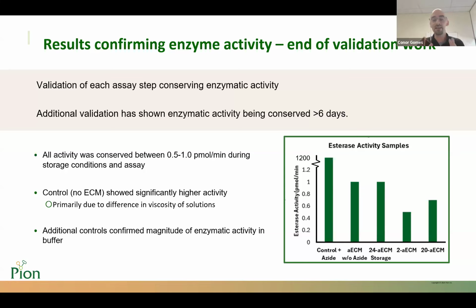And we have data that's not shown within this webinar, but we have a little bit of validating data where enzymatic activity can be conserved after 6 days of manufacturing these ECMs, which opens up the door for longer acting assays.